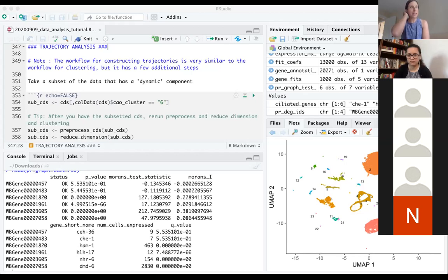Aishwarya, I don't know if this has happened to anybody else, but after I did the CDS subset and my 2 clusters, it totally kicked me off R during the tutorial. So I just had to start a new session and reload. But the pop-up worked, and then you chose the 2 clusters.